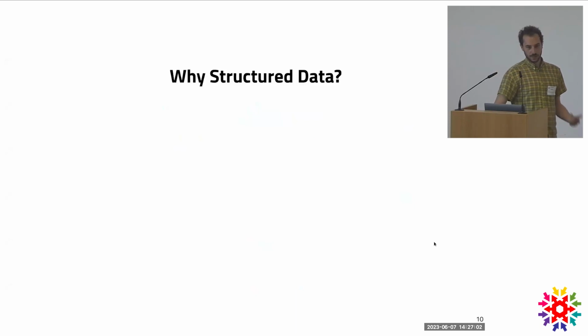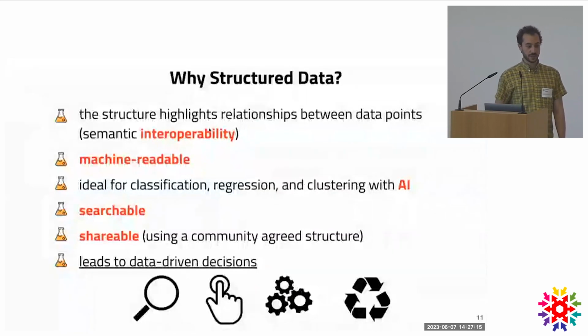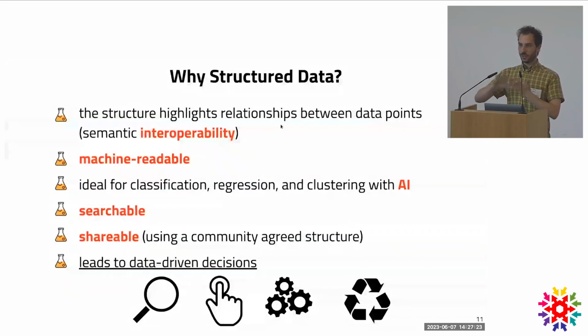Now it's again very important to underline why the structure of the data is important. Actually, there are several reasons for which it's important. The first is, I would say, just the interoperability of this data, because whenever we share a language among different, let's say at a different scale, then we can also share what we mean. And so the data becomes more interoperable. And this is also fundamental for the machine readability.